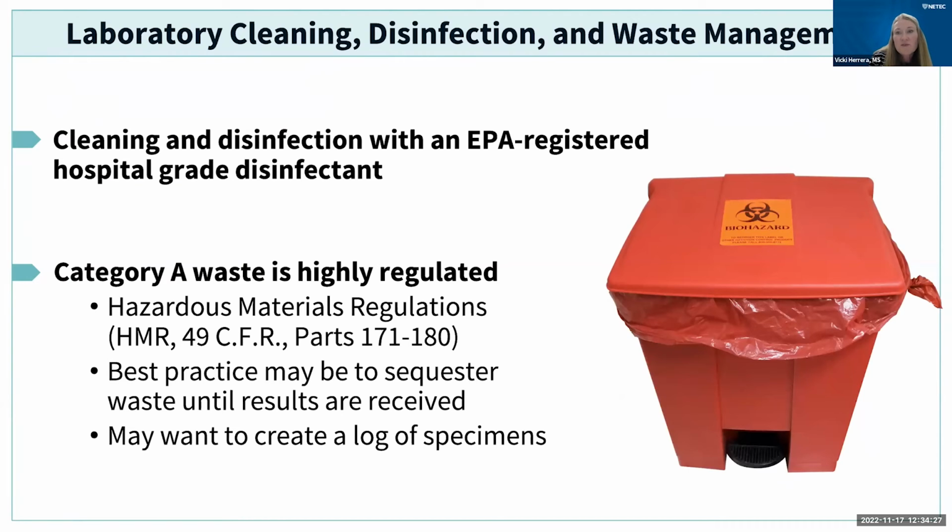So other considerations: laboratory cleaning, disinfection, and some waste management. Waste management is always a big one on the list. The cleaning and disinfection, let's talk about that first. Make sure that you have an EPA registered hospital grade disinfectant. The EPA's website provides a list of disinfectants that are approved for Ebola.